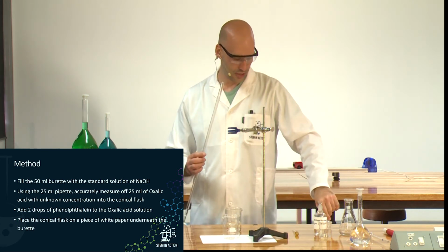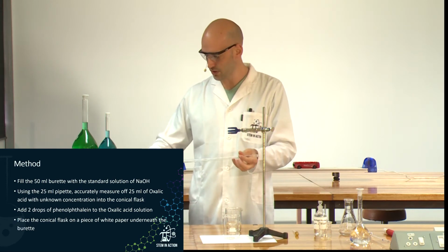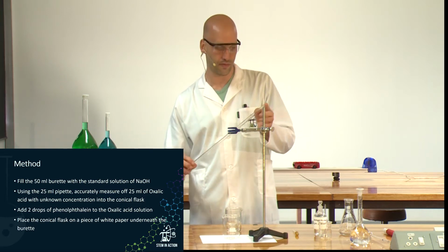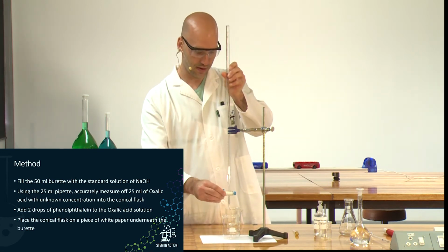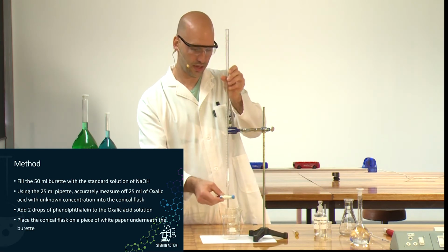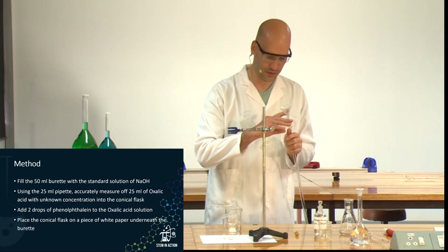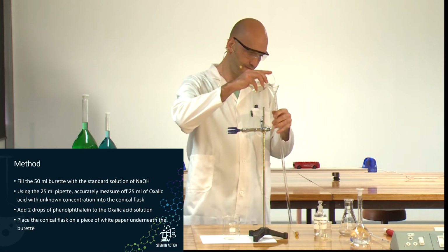I'm going to put this down again and take this. I'm just going to give it a quick rinse, to make sure that everything inside is what we want and there's no residue from a previous experiment. I'm going to empty it into my waste beaker over here. Nice and clean. Then I'm going to fill it up with sodium hydroxide, just pour it in there.